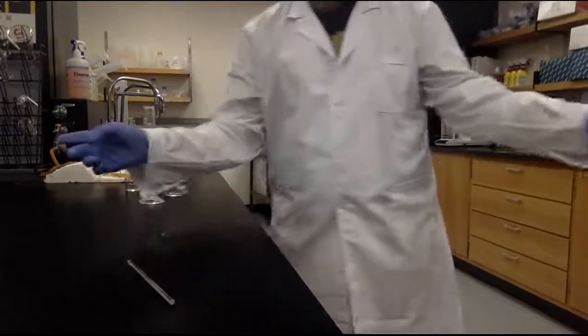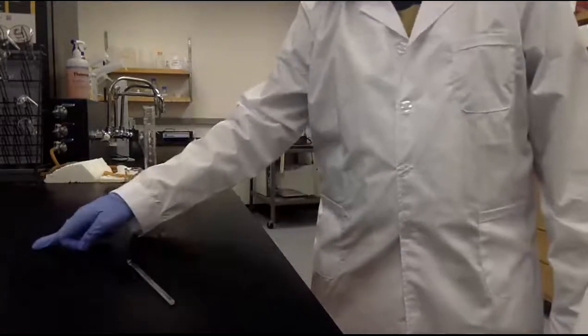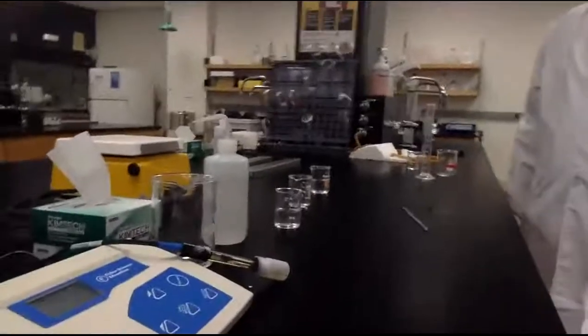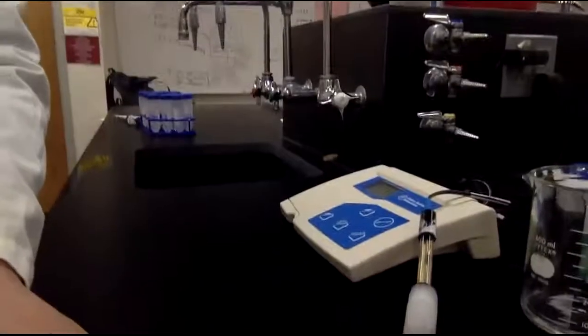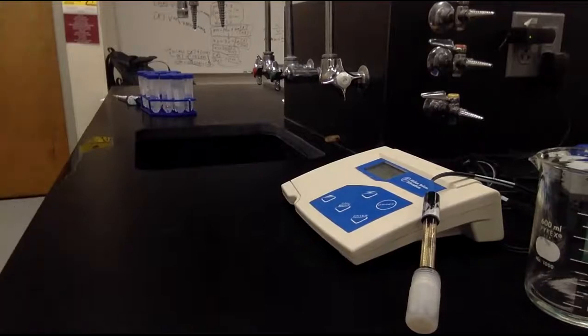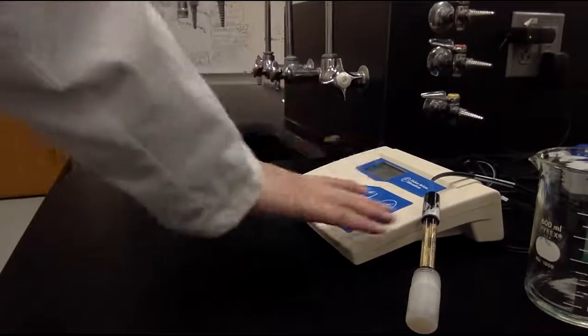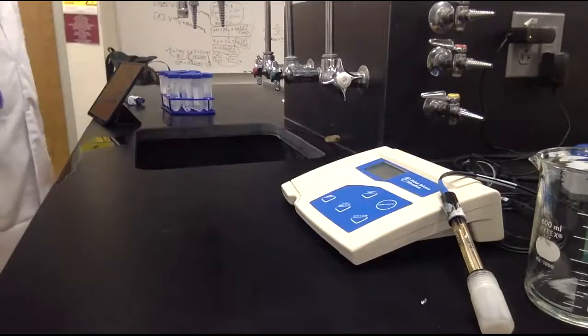I believe we're done preparing the buffers. Yes. Strong acid and weak acid plus base. So next step is measuring the pH, the actual pH value for this. Okay, so this is the pH meter. So how do we use that? So this one is the panel. Basically, there's a very tiny screen which shows the pH. This is the pH probe, the pH meter probe.